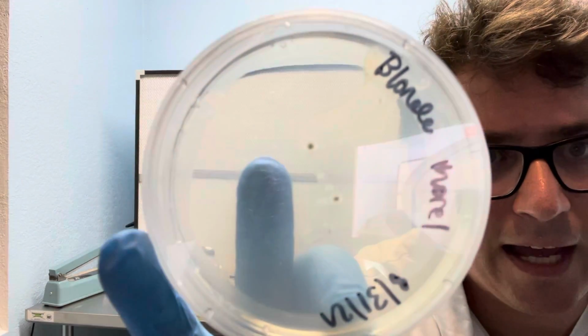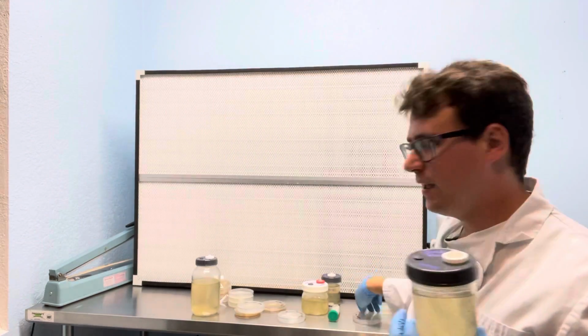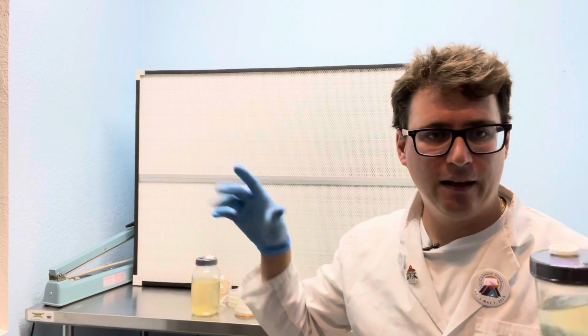But you can see right here, that is the start of probably some penicillium mold, and typically the morel culture will be really spread thin.